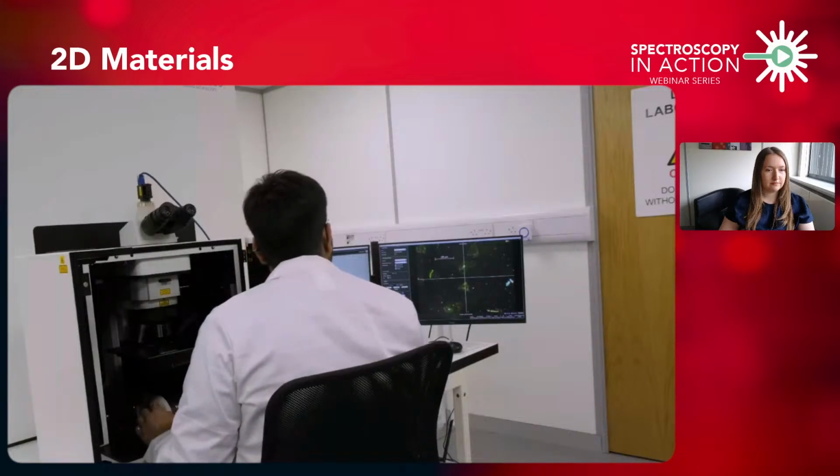The next thing I'm going to do is change it to the dark field illumination. And we're going to use this for the Raman imaging. So now we have our sample in focus and the microscope set to the correct conditions. We're able to run our instrument for the respective Raman, PL, and SHG measurements. Now back to Angela, who will explain the fundamentals of each of the techniques.